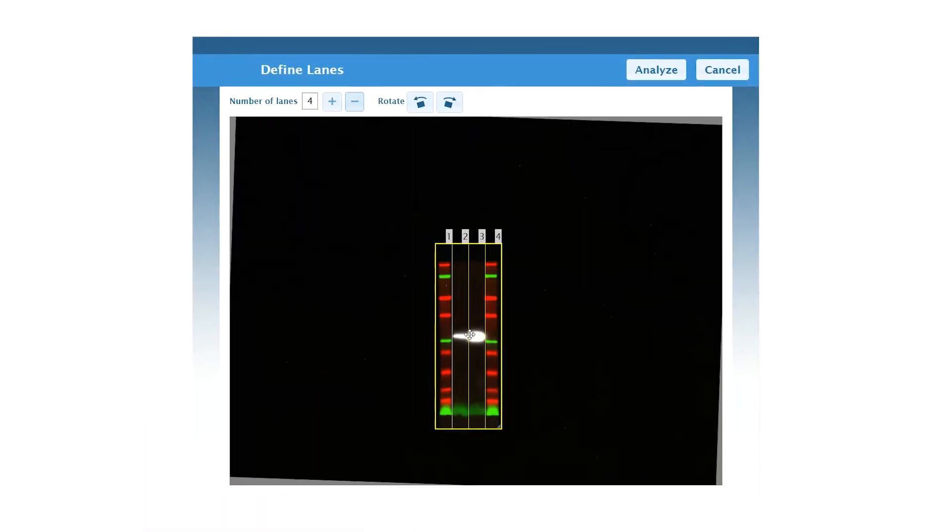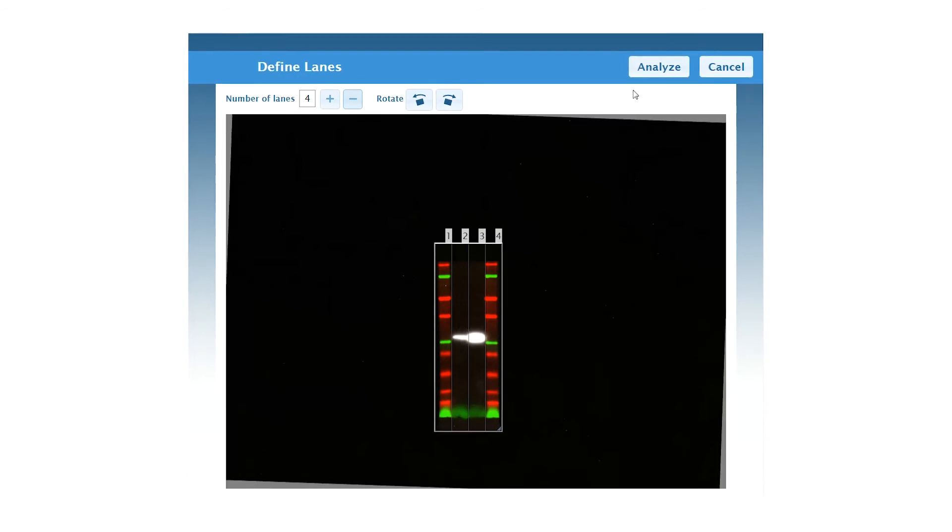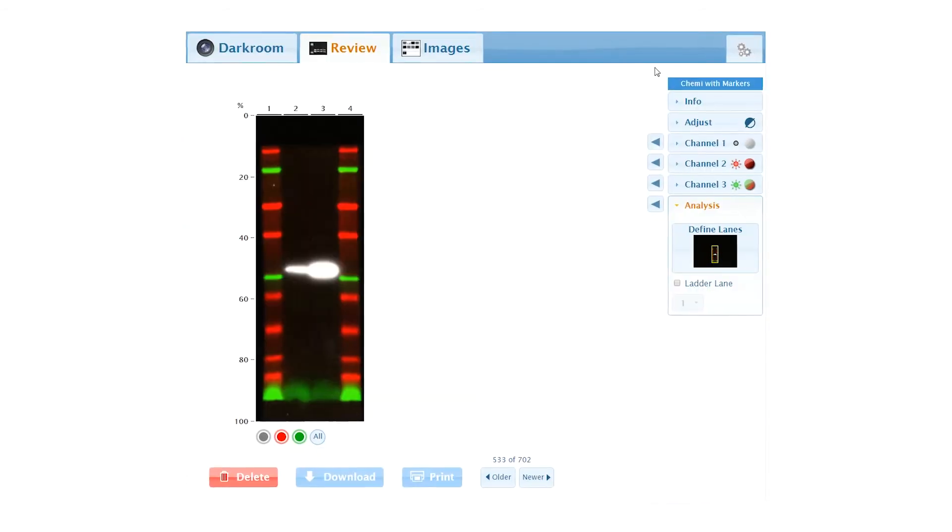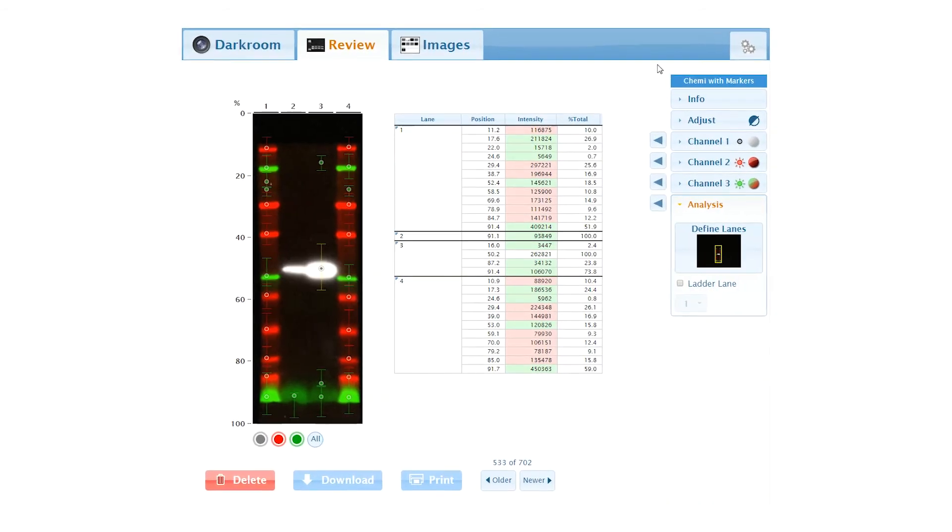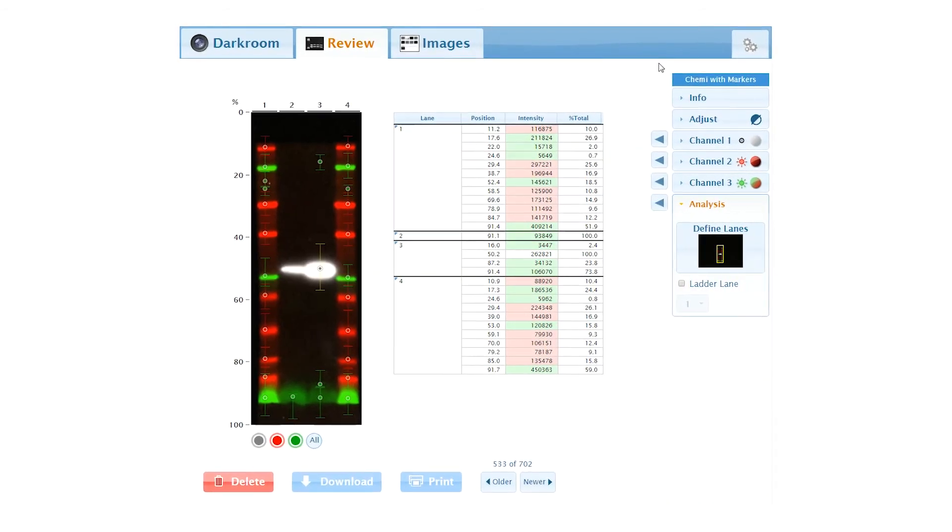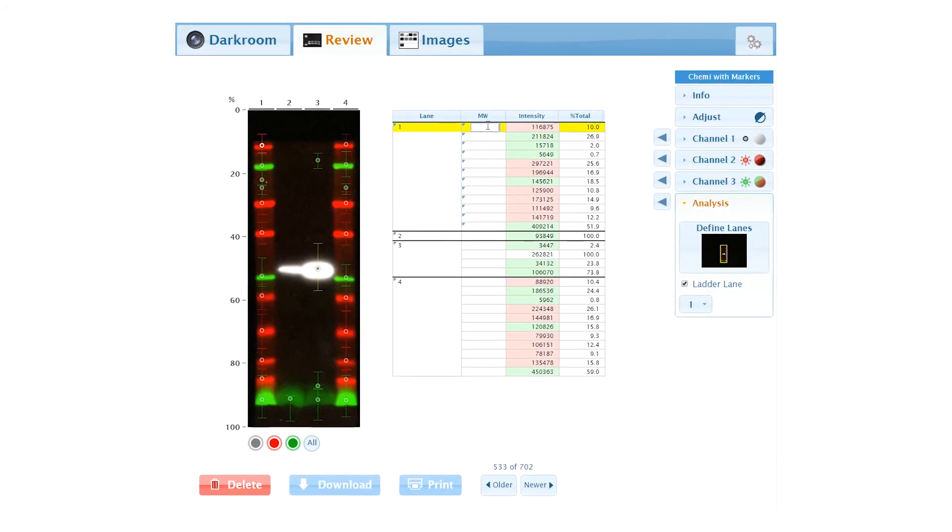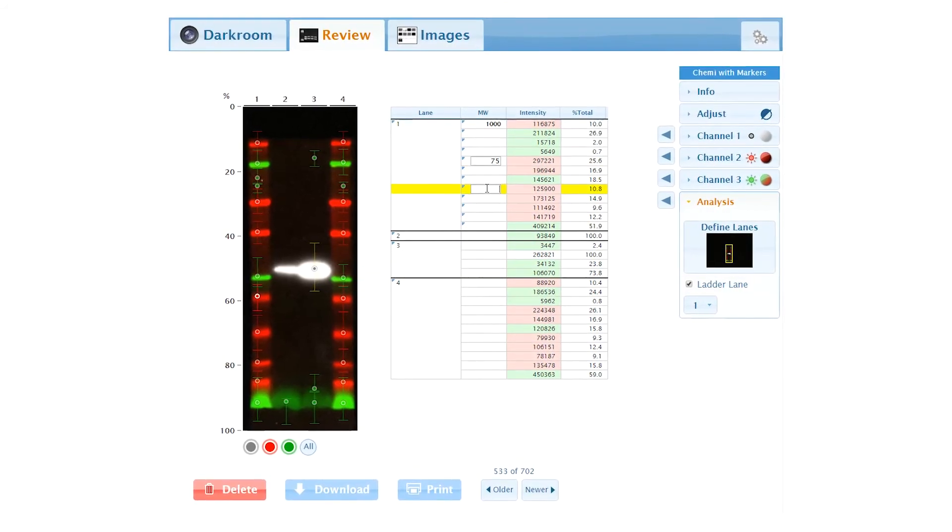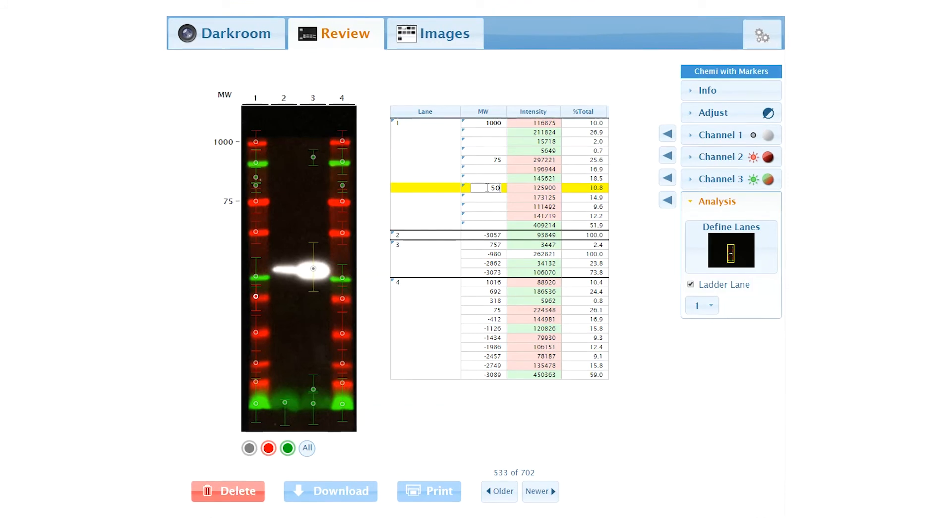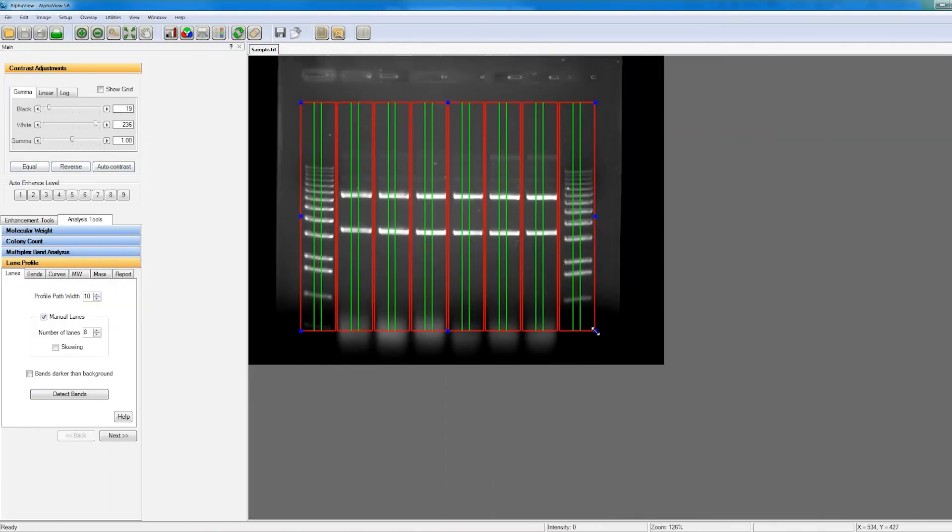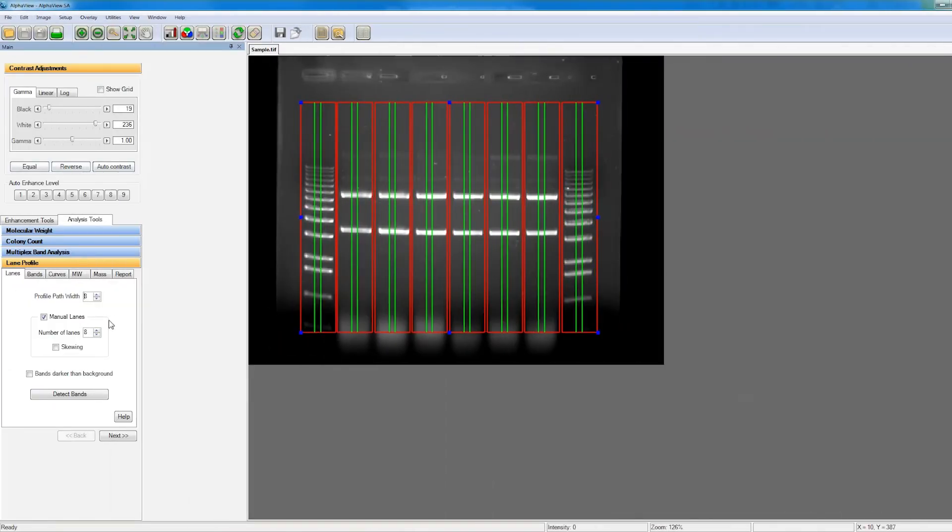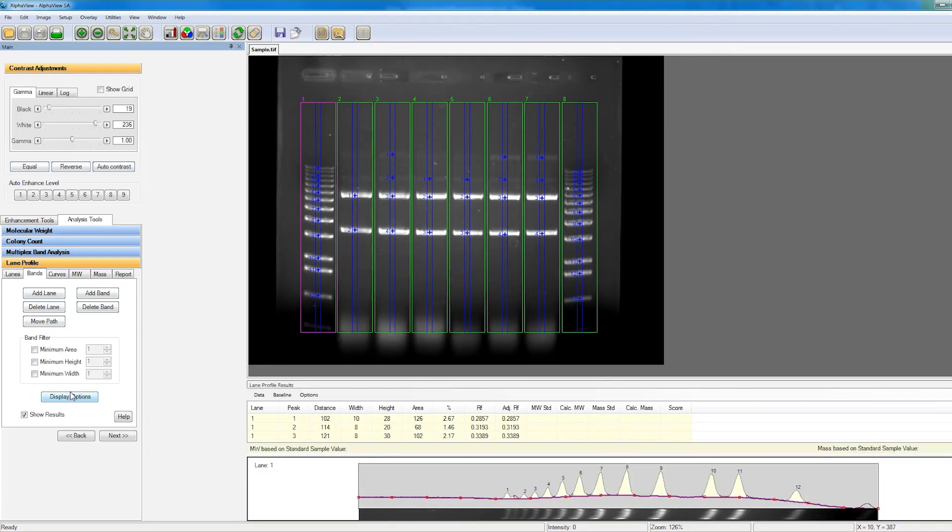Analysis can be done right in digital darkroom. The analysis feature allows you to define lanes in the sample and define molecular weight markers, giving you quick, on-the-spot molecular weight determination of sample bands. Our AlphaView standalone software is also included for more in-depth analyses.